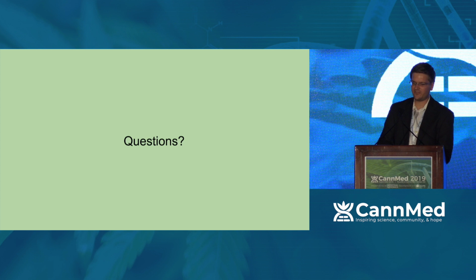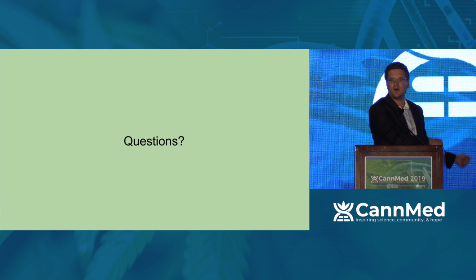Actually, yes, I have. I found it on a YouTube video that's pretty readily available if anybody wants to look for it, of a couple very large-scale production labs that have automated media pouring techniques. It'll pre-make the media in the autoclave and then pipe it as a flat moves along a line. That flat fills every single tube, and all of a sudden you don't have anybody filling tubes. You have people picking them up, setting them on the rack, and pulling them off the rack pre-filled. And then would you repeat your other question, please?